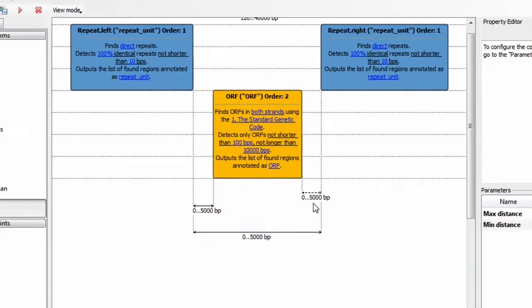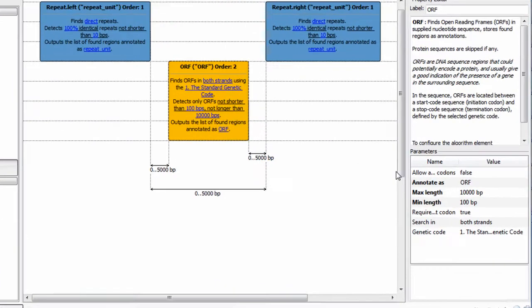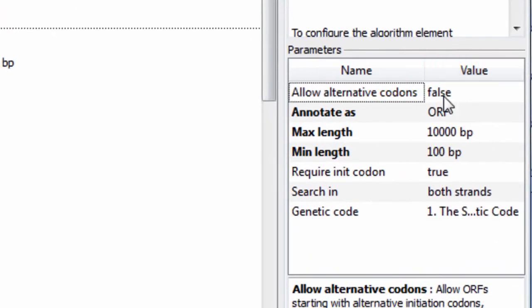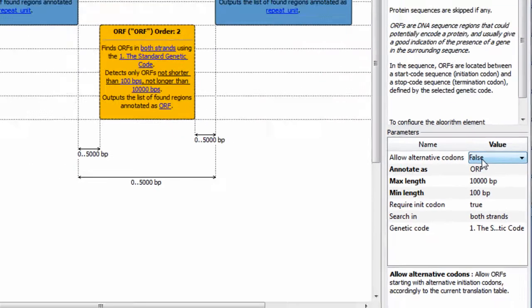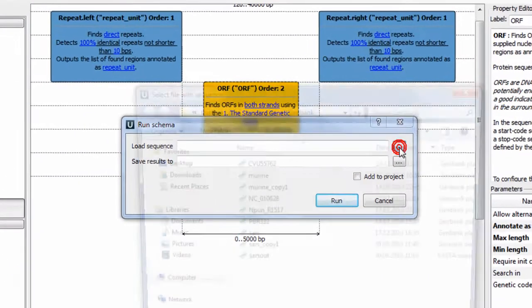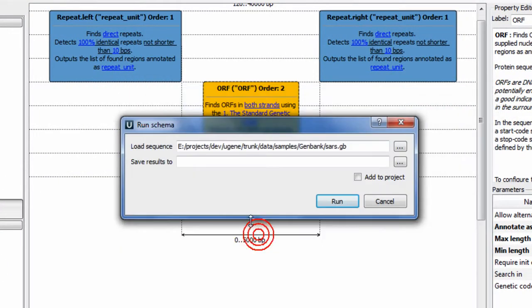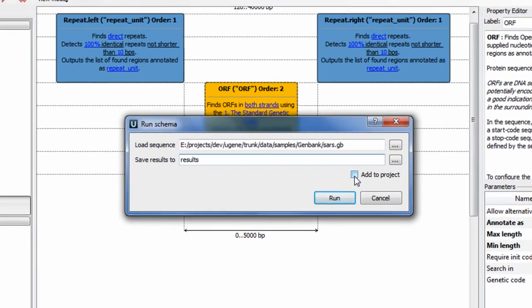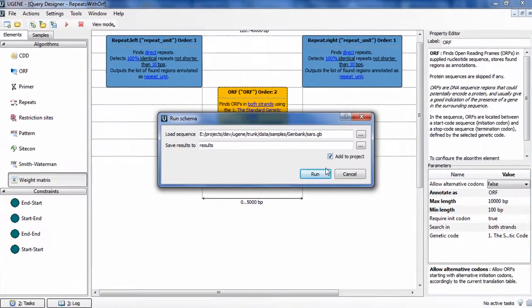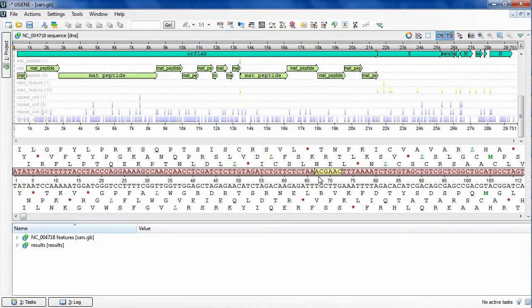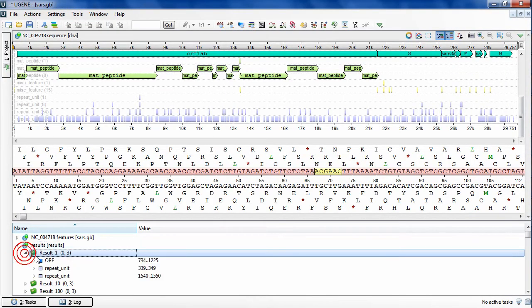The search algorithm parameters can be specified the same way they are specified in the Workflow Designer. When the schema is ready, I press Run Schema and use it on a particular sequence. The search results are saved as annotations and can be automatically displayed. The found results match the designed query.